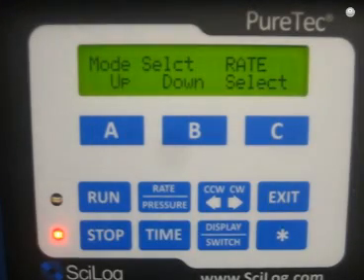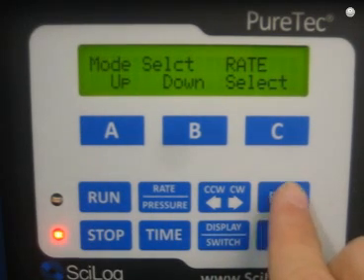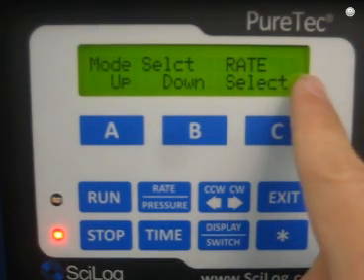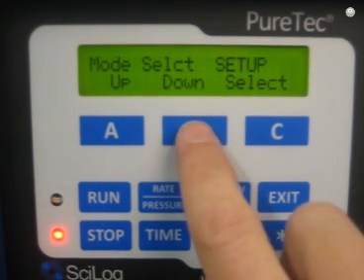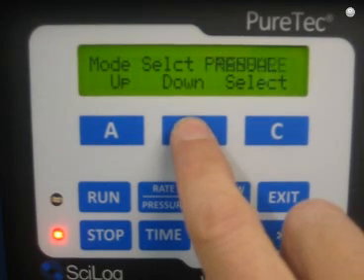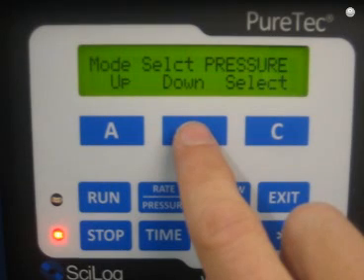The PureTech was engineered to be very easy to use. It has four operation modes. If I exit three times, I end up at my home screen which is constant rate mode. The other modes are setup mode, manual mode, and constant pressure mode. Constant pressure is where you can set a TMP like 15 or 16 psi and then have the system automatically do your concentration or diafiltration for you.